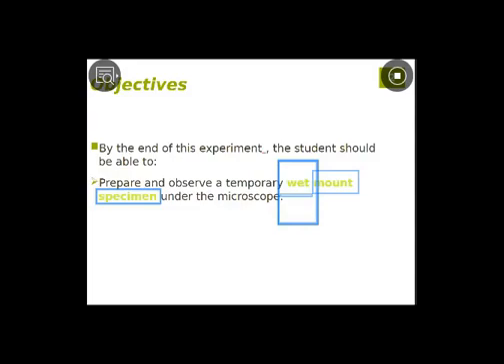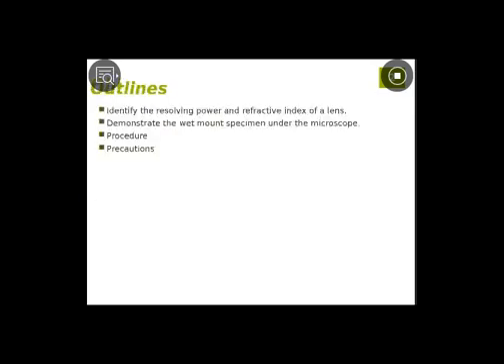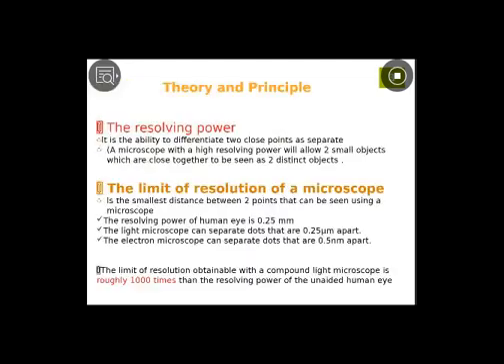So today in this experiment we are discussing the wet slide. The next experiment will be about the dry slide. Okay, so today we are discussing the wet mount. What is wet mount? I will discuss. Dear students, first of all, the thing we want to discuss is resolving power. Resolving power is also called resolution.